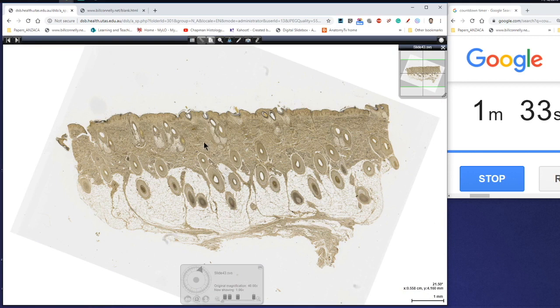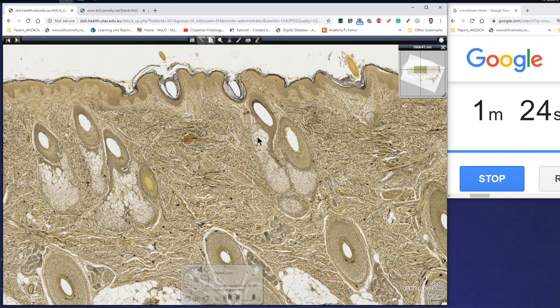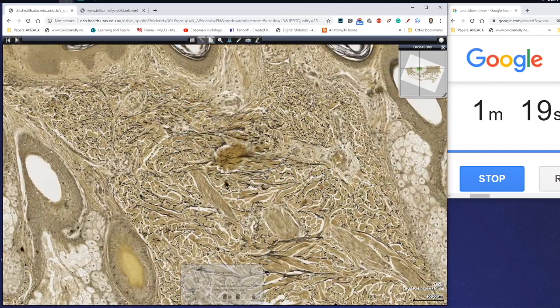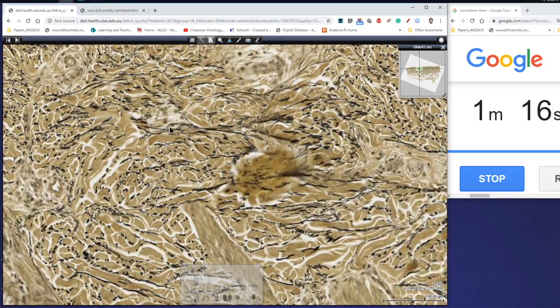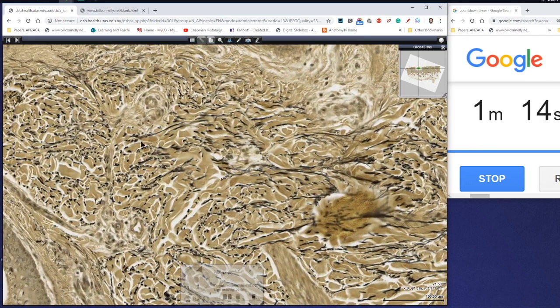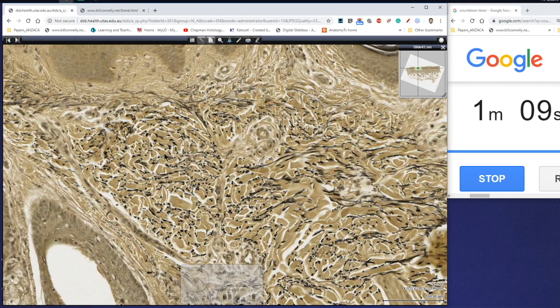Here we've actually got a stained section which labels elastic fibers in particular. This is thin skin — we can see some hair follicles and some sebaceous glands here. If we zoom in, you can see these black fibers, which are actually bundles of elastin. You can see there's a relatively high amount of elastin present within the reticular dermis.